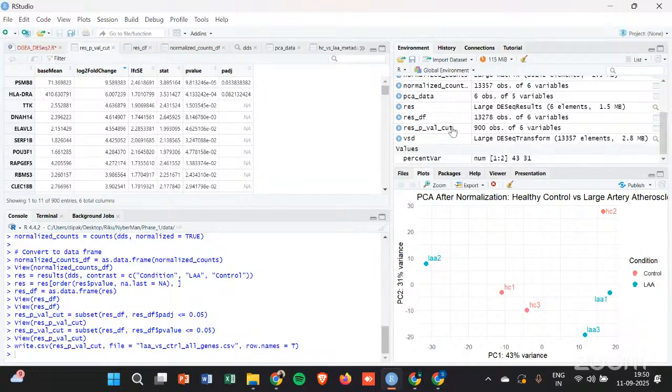But then again, it is also important as a biologist for you to explain the biological phenomenon, for which you need a good enough number of genes, right? Only 40 genes cannot explain a total biological phenomenon. That is the reason why I have taken p value here. Whenever you do, just report that instead of p adjusted you have used p value, and explain why.